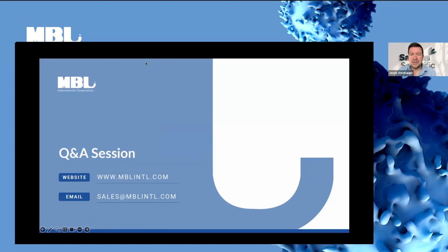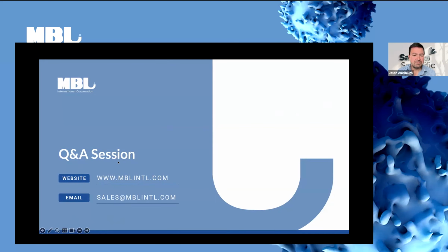All right, very good. Is there an A3 mutation in class 1 QuickSwitch tetramer? Yeah, I believe so. We'll have to get back. I believe so, but I'm going to have to get back to you on that one. I'm sorry. All right. Sounds good.